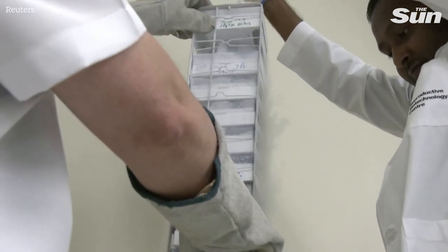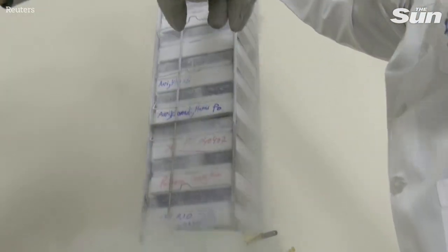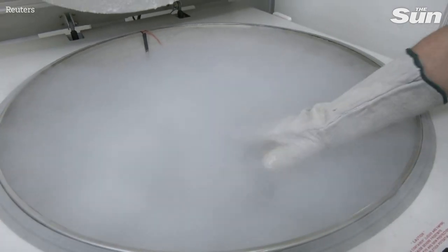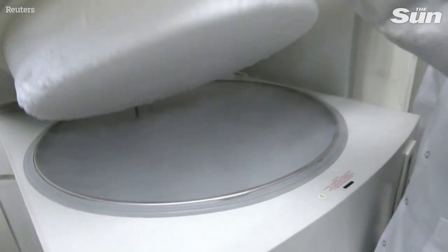This is a cell line from 2007. This is a cell line from 2008. This is a cell line from 2008. And it's about minus 145 degrees centigrade temperature here. They are stored for long-term storage.